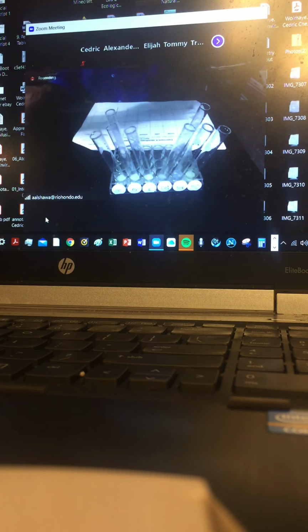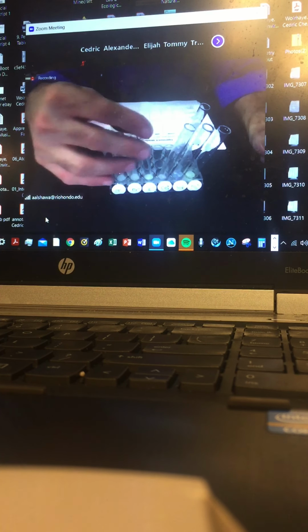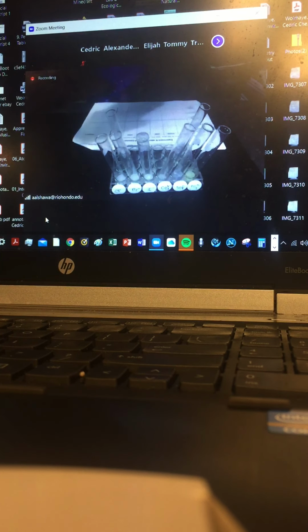All right. The last part of the silver nitrate test, the one that would expose only the halides, is to add some acid. We definitely want to avoid anything that has to do with chloride or sulfate, so I want to use a nitrate, so nitric acid. It needs to be high molarity, but I don't have much of that, just half a molar, which is sufficient, but then I need to add a good amount.